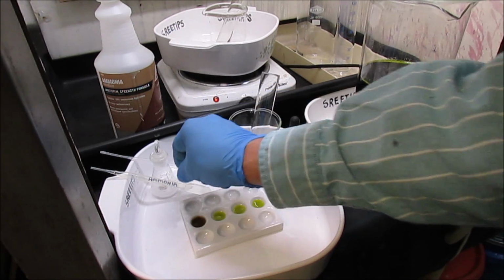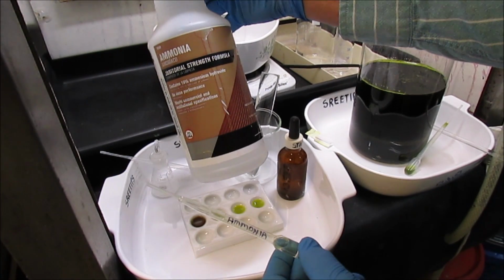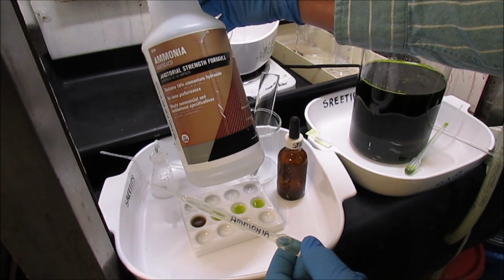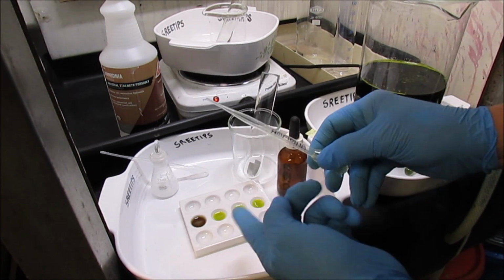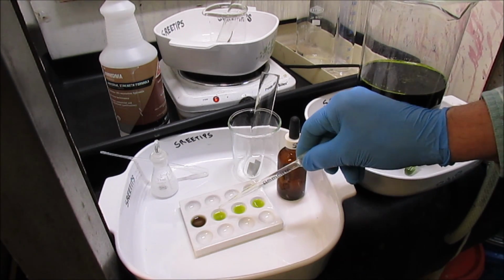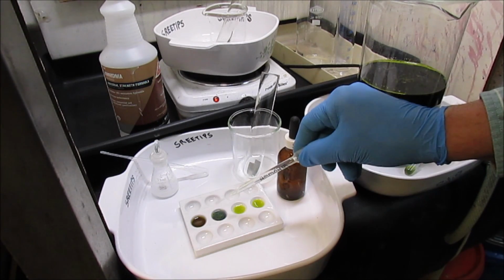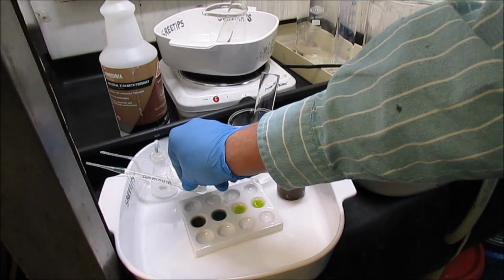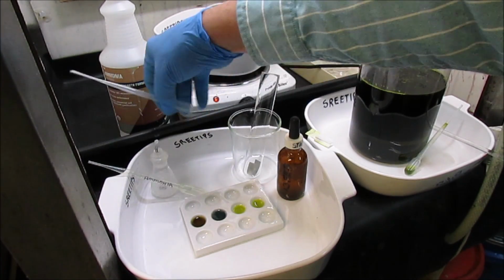Now in this cavity, I've got some 10% household ammonia from the grocery store. What I'm going to do is put the ammonia in this cavity right here on some of my solution. And you see that blue color, that means copper. So I definitely got copper in solution with the platinum and the palladium.